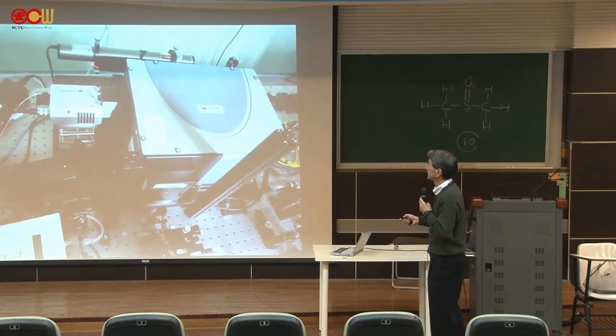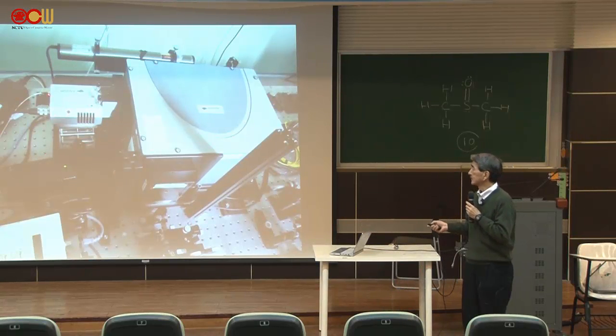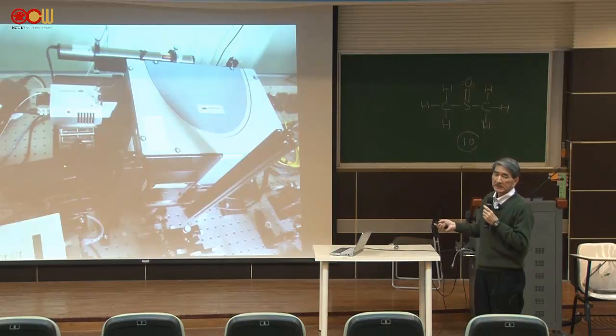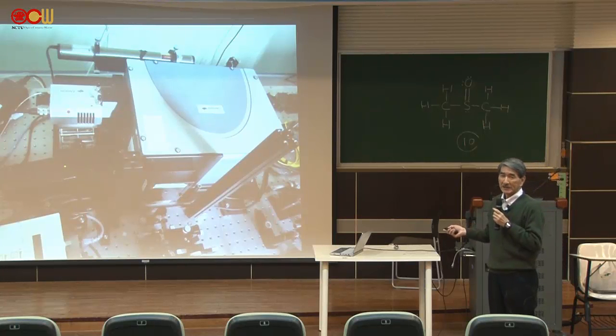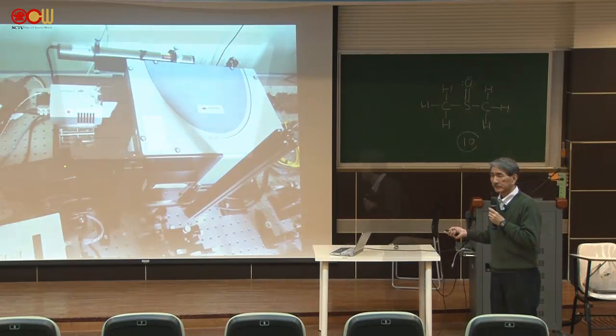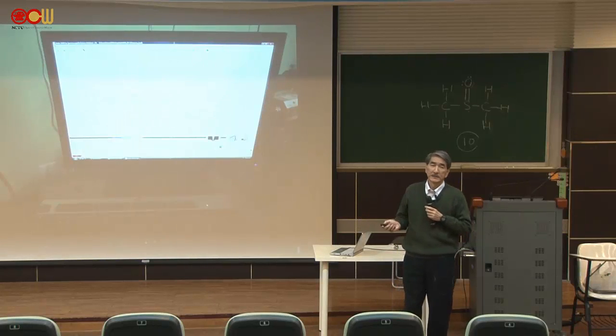Now this is a CCD, much smaller. In this case, we do not cool the detector by liquid nitrogen, but we cool it thermoelectrically by using the Peltier effect.